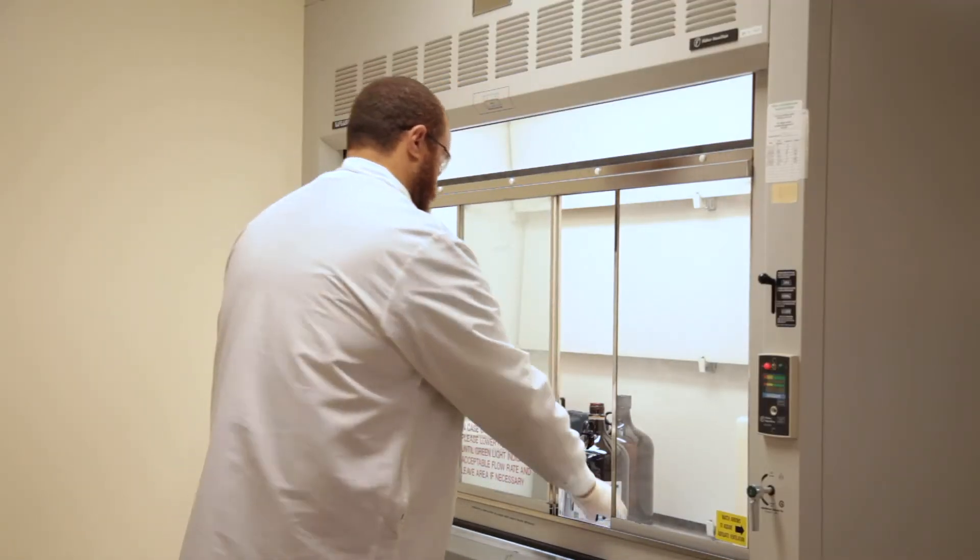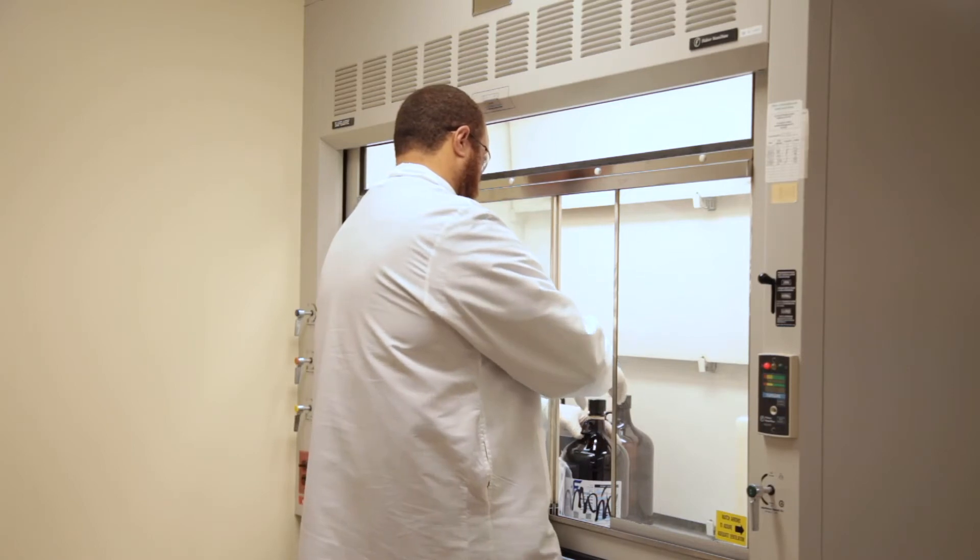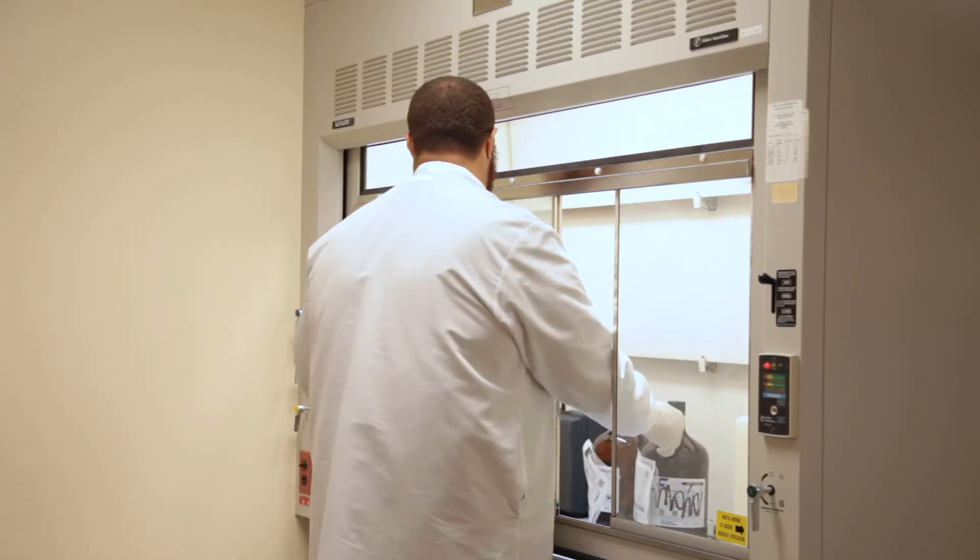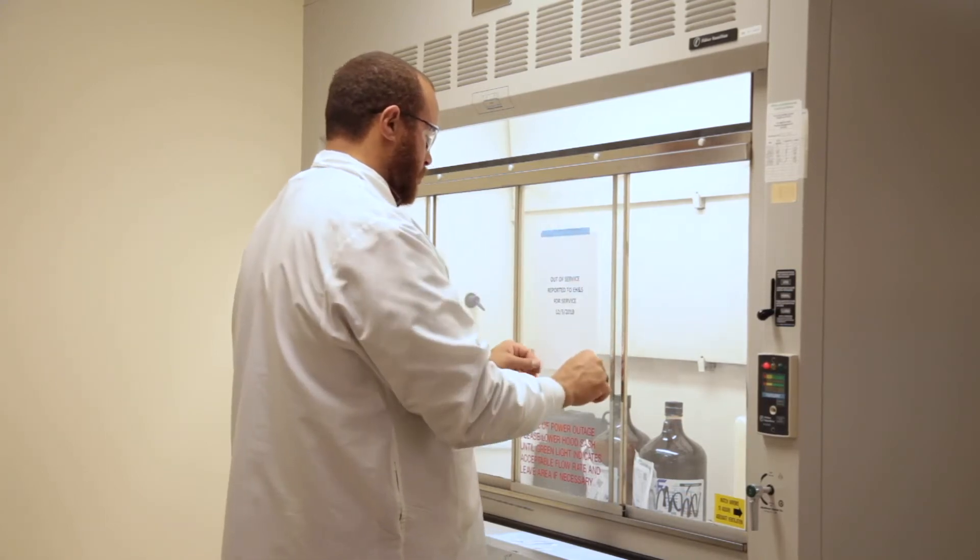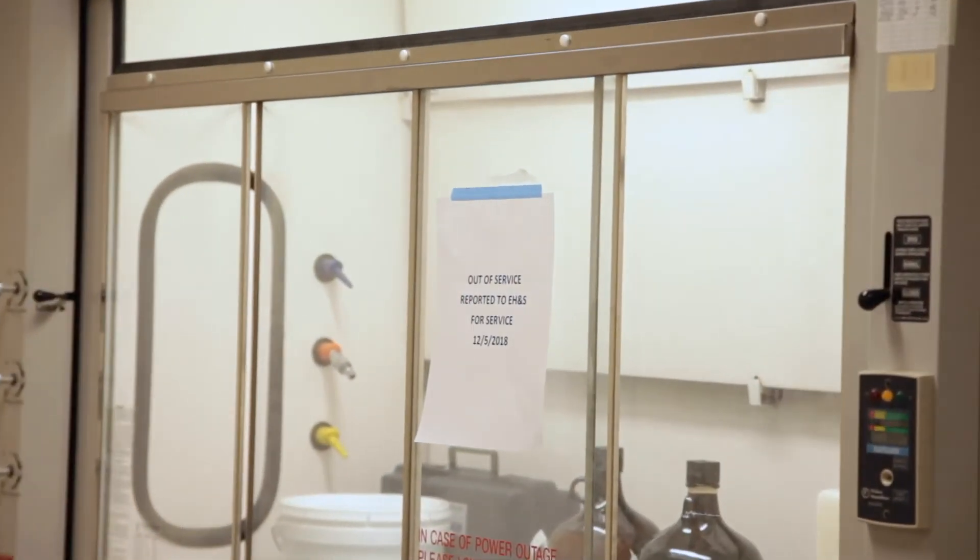If you notice a fume hood is not functioning properly, stop using the hood, close all the containers, close the sash, put a Do Not Use sign on the fume hood, and submit a work order to Facilities Management for repair.